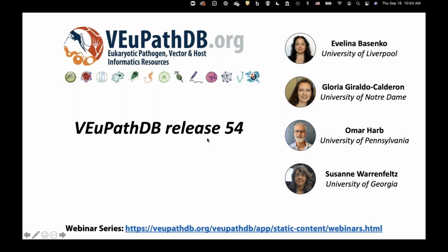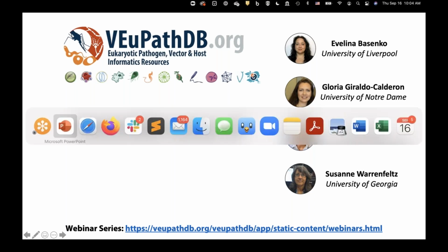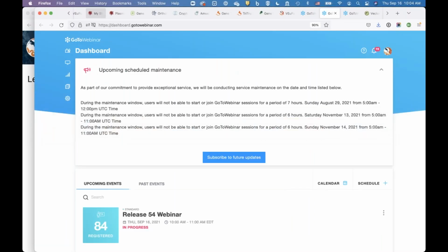Our goal with all of our webinars is not simply to give you a rundown of a list of data sets, but rather to demo some of them and highlight some of the cool tools and features that you can use within VEuPathDB to answer the questions you may have using these new data sets. Of course, everything we show you today is applicable to any other data sets available within any of the VEuPathDB resources, since we're all built on the same infrastructure.